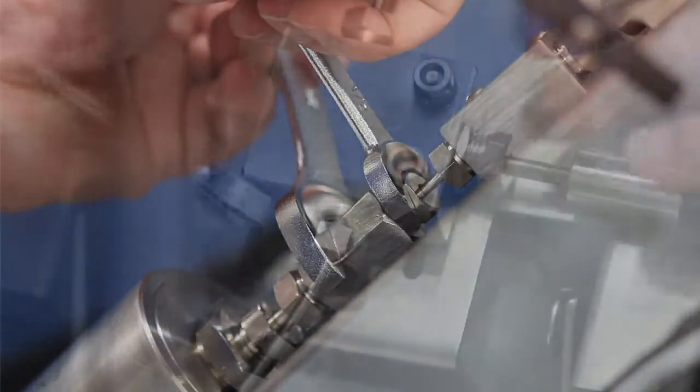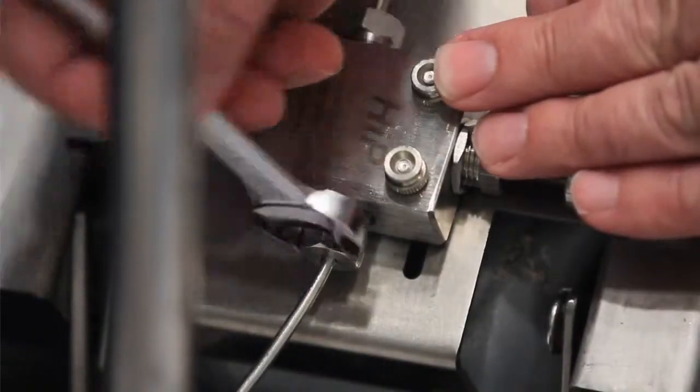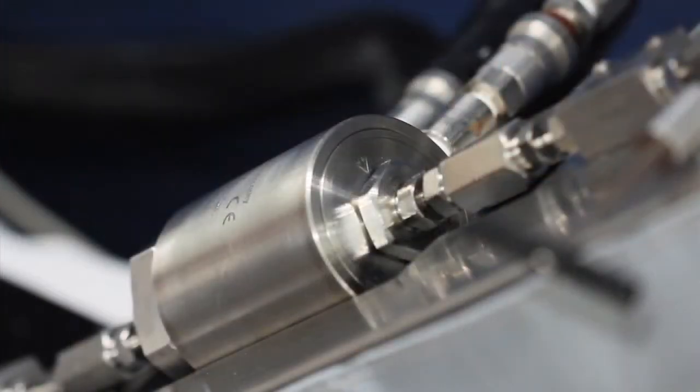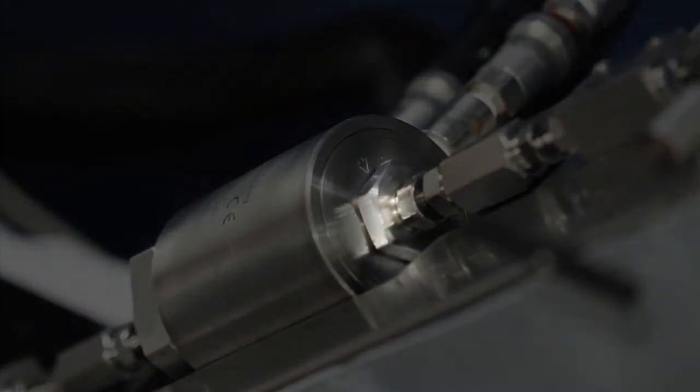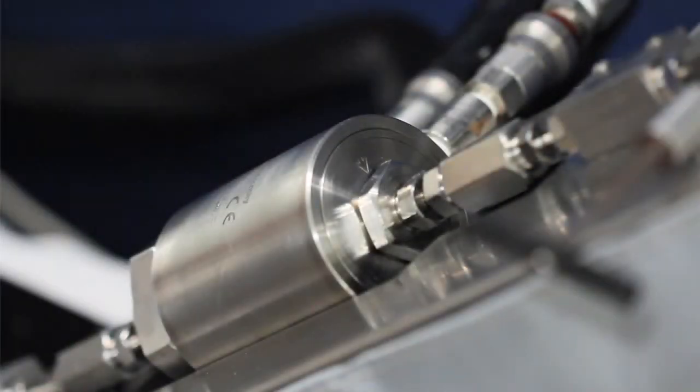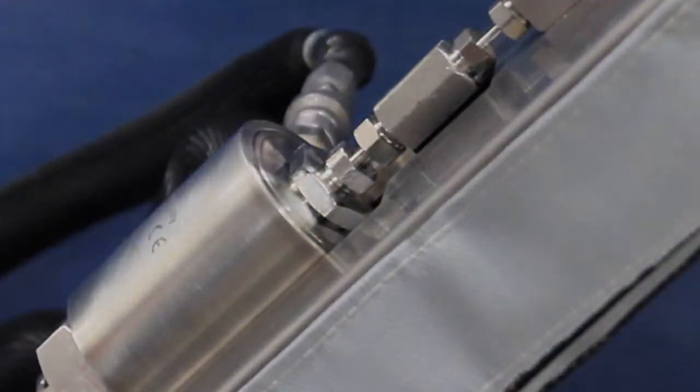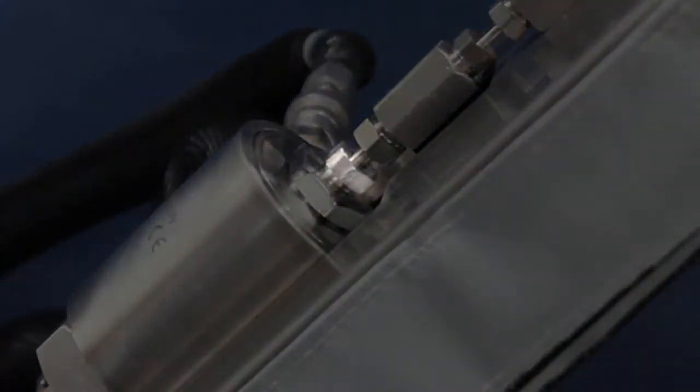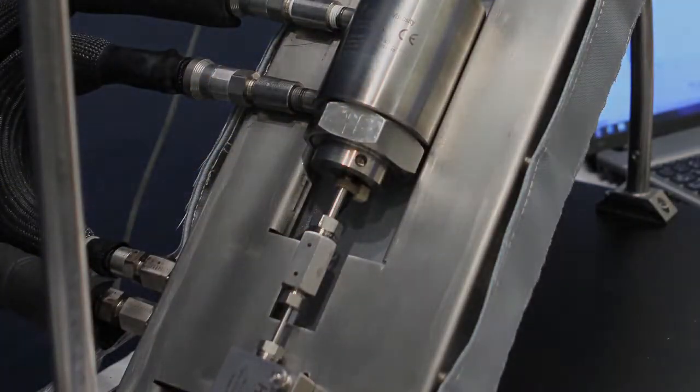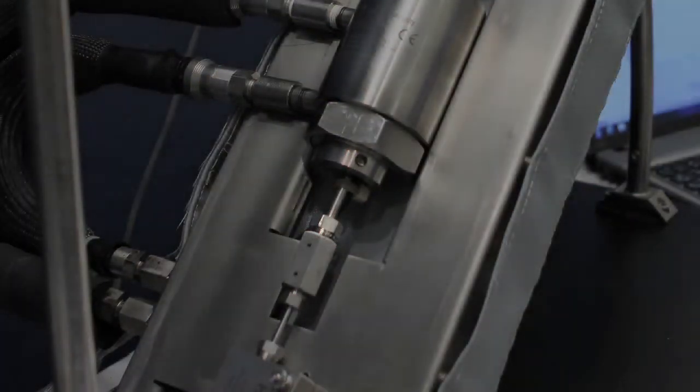If pressure continues to drop, check all of the fittings for leaks. The large gland nut should be torqued to 110 foot-pounds. The low torque nut should be torqued to 65 foot-pounds. The rest of the nuts should be torqued to 25 foot-pounds.